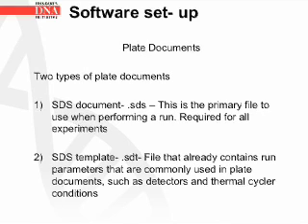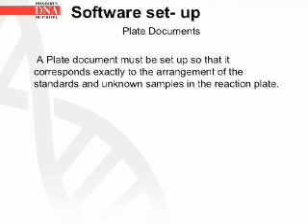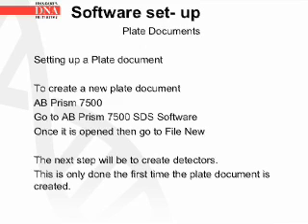An SDS template, which is a .sdt file, already contains run parameters that are commonly used in plate documents, such as detectors and thermal cycle conditions. A plate document must be set up so that it corresponds exactly to the arrangement of the standards and unknown samples in the reaction plate. Now let's go through step by step how to set up a plate document.